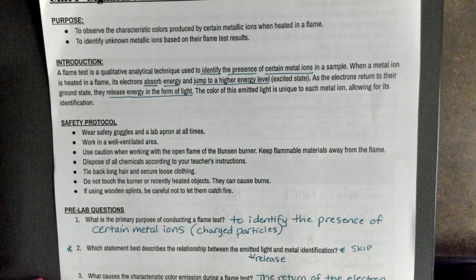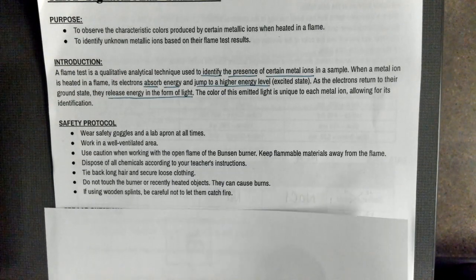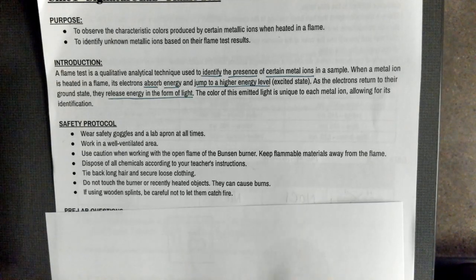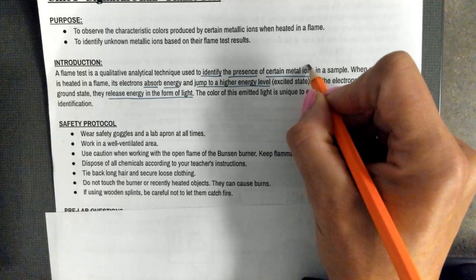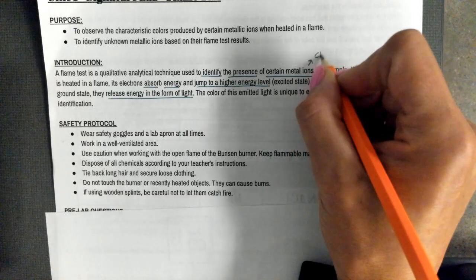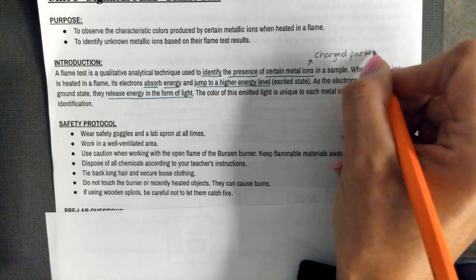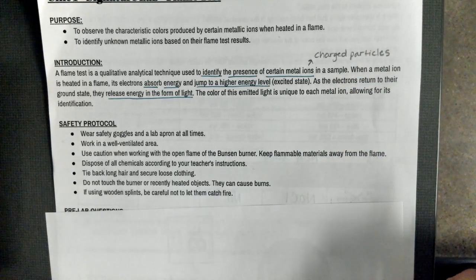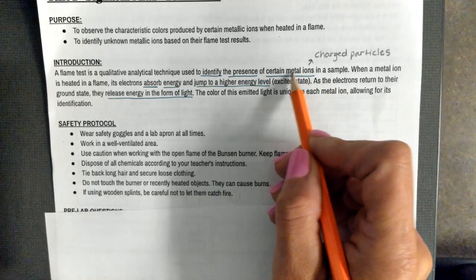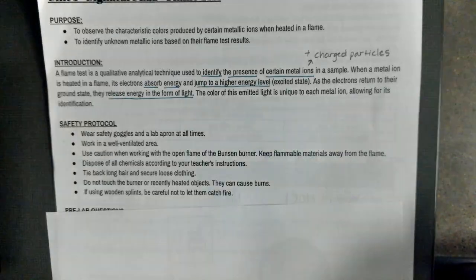So a flame test is a qualitative analytical technique used to identify the presence of certain metal ions. So we've talked about ions in class, and we know that ions are charged particles, because they're either losing or gaining electrons. Now, because we're talking about metal ions, they're actually going to be positively charged particles.